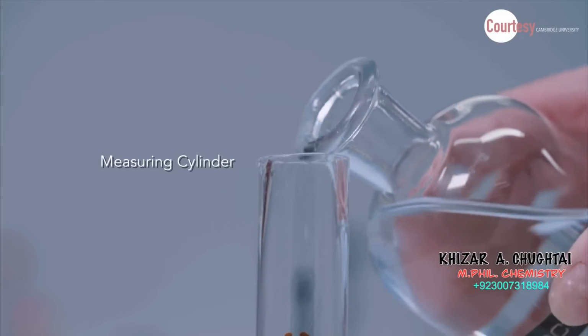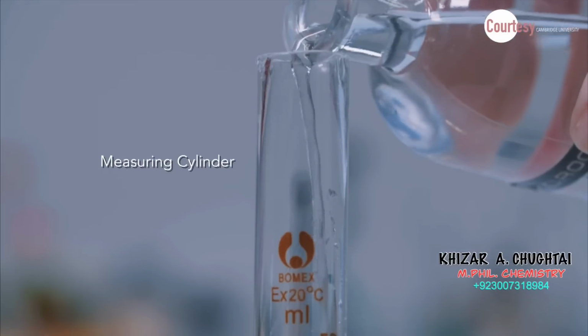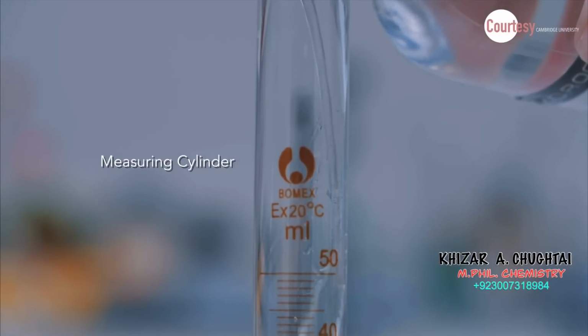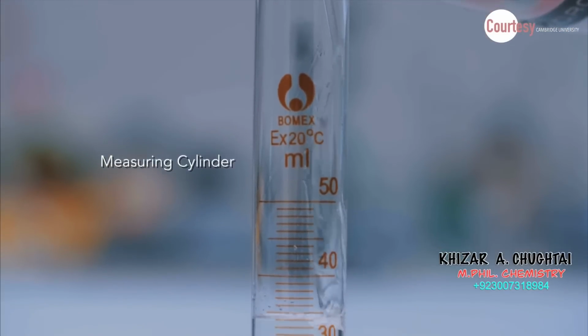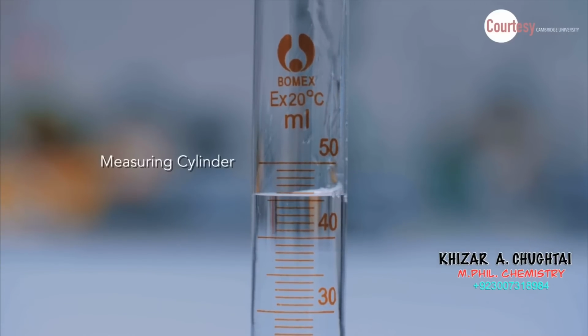Using a measuring cylinder, measure out 50 cm³ of 2 mol per dm³ hydrochloric acid. To ensure you have exactly 50 cm³ of acid, you can use a pipette twice.